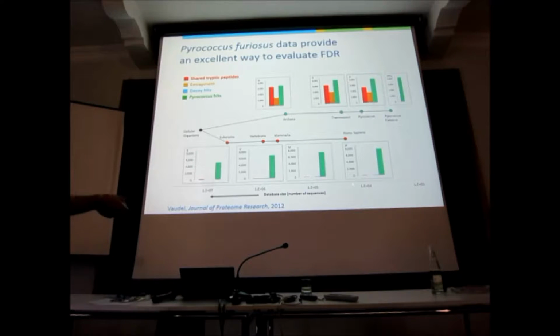And you see that this works, right? You see that the amount of Pirococcus hits is always lower than what you would expect from the hits. But notice that we're doing something. Here we include Homo sapiens, which is about this size database. Here we include all Mammalia, which is this size database, 10 times bigger. Here we include all Vertebrata, which is yet another 10-fold bigger. And here we include all Eukaryota. And notice the overlap between all possible Eukaryota that we've ever gotten sequences from and Pirococcus is absolutely minimal. Right? There is practically no overlap.